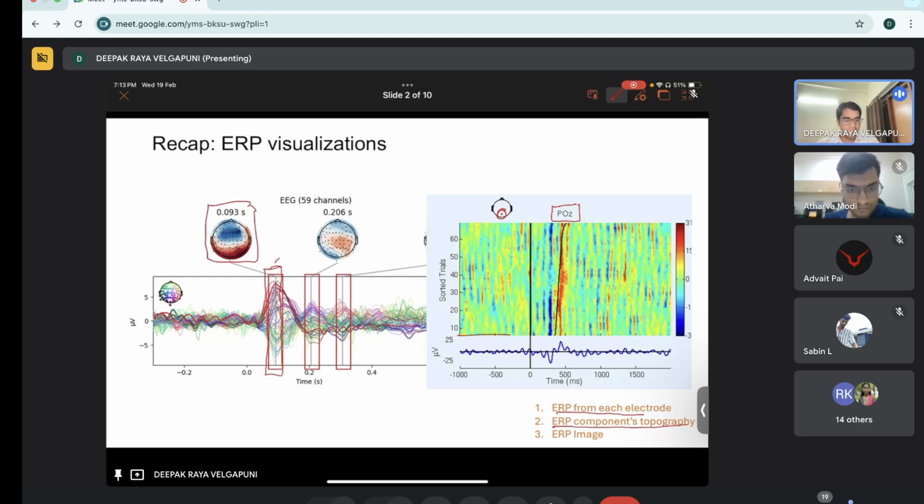So this black line you see, right? This black line here is nothing but sorted trials. So instead of plotting each trial sequentially, you sort it based on some metric of the task, and then you plot for each trial, which gives an ERP. Generally trial-wise ERPs are very variable, so unless you average, you don't see it.